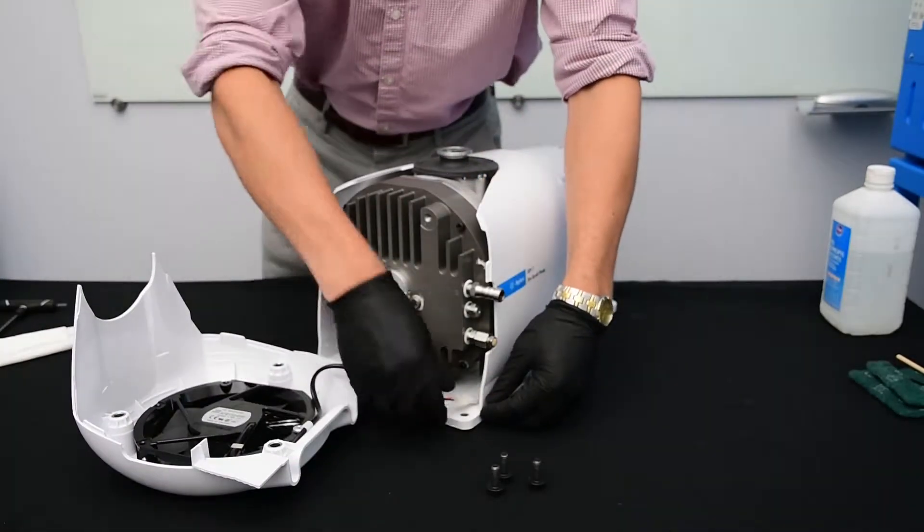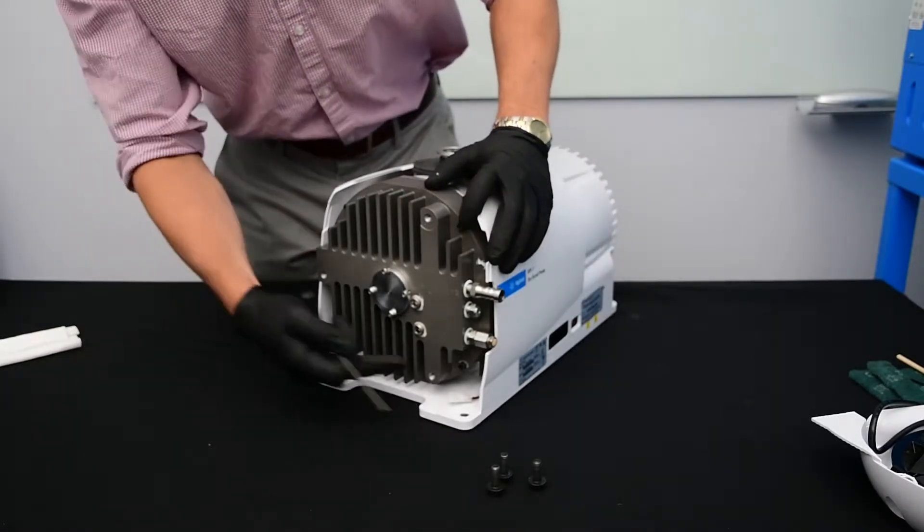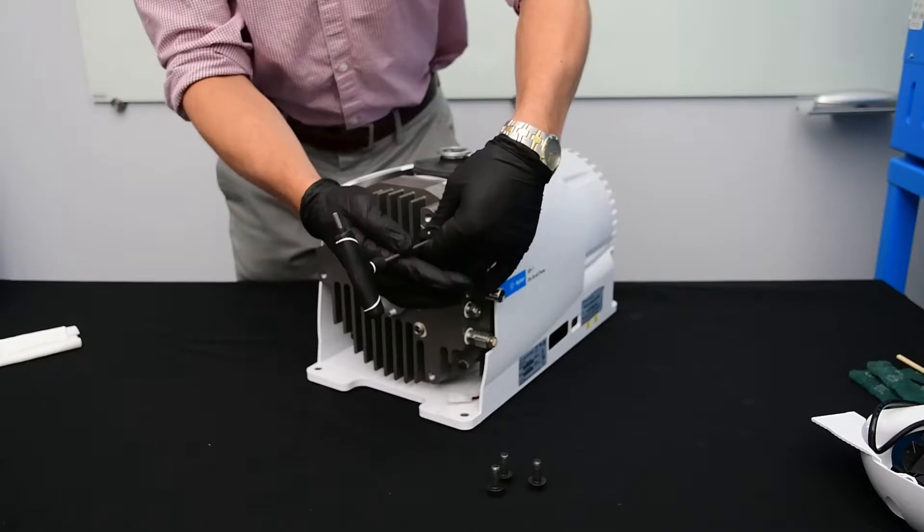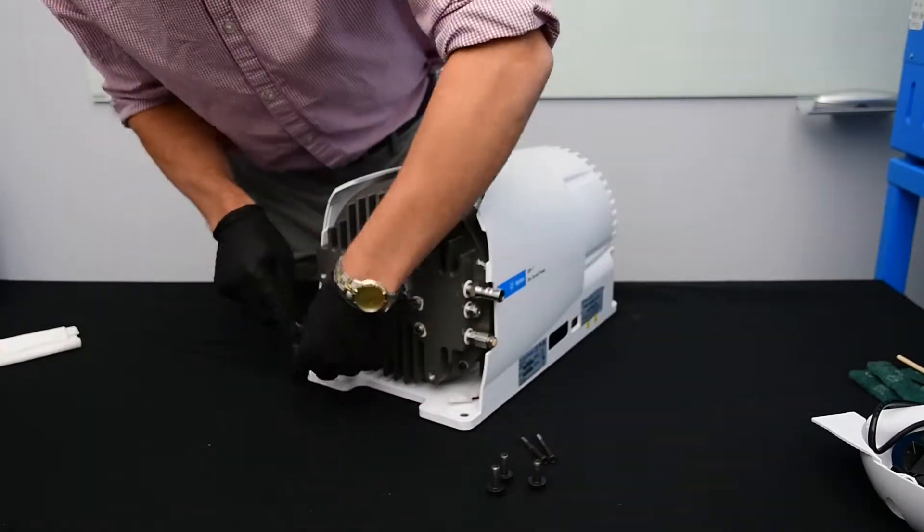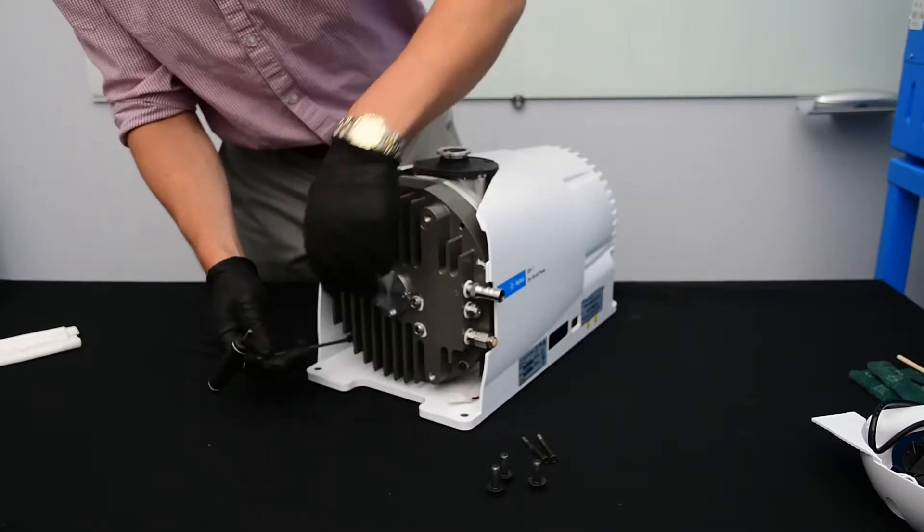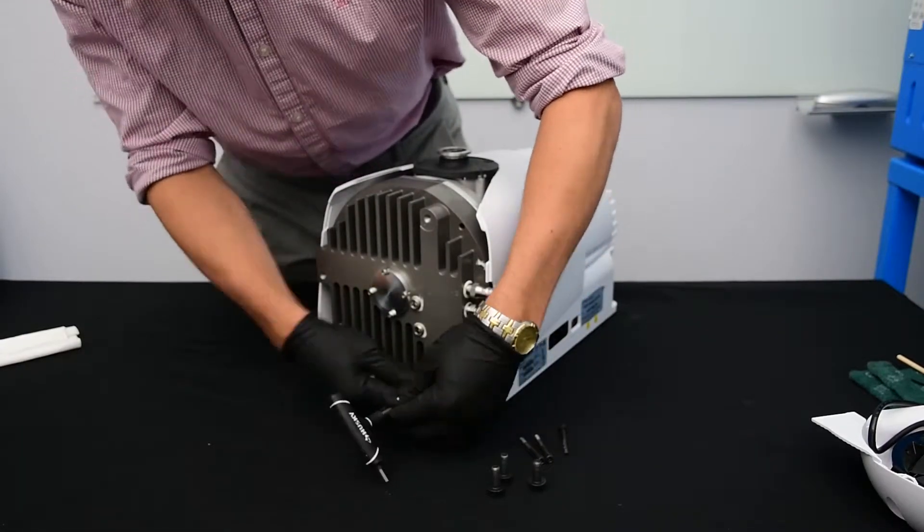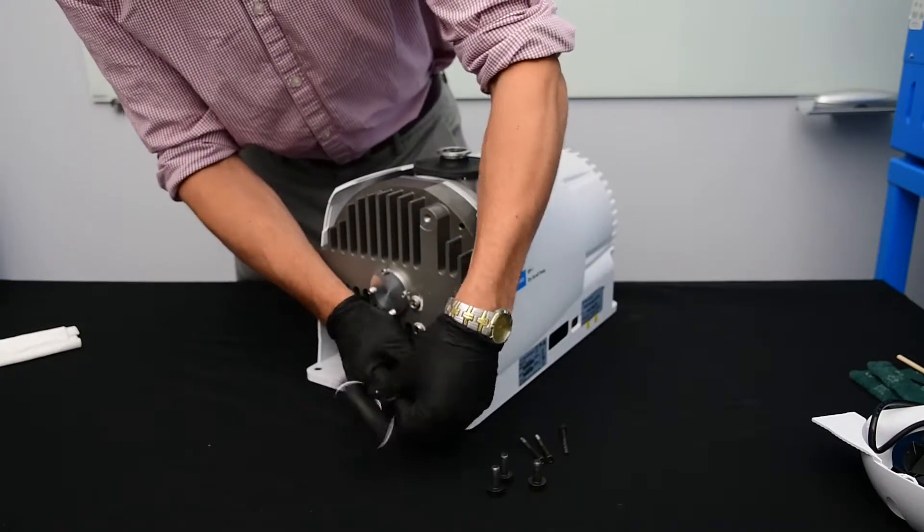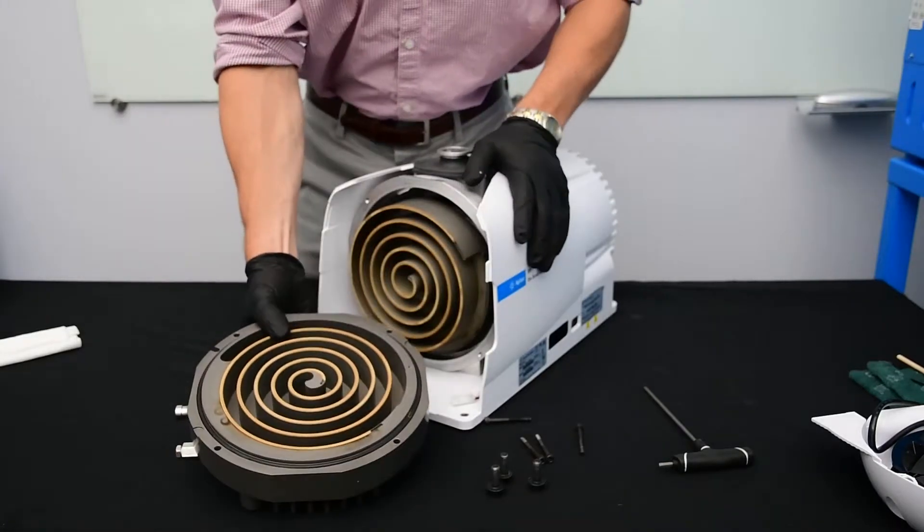We'll remove the cowling and disconnect the connection for the fan. Now we've removed the cowling, we'll remove the four 4mm Allen screws. We'll remove the cowling.